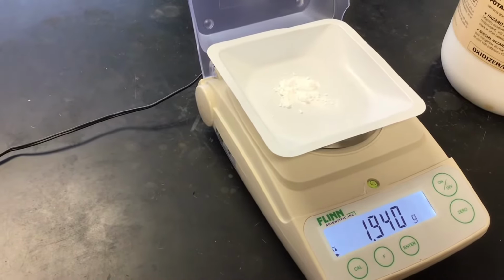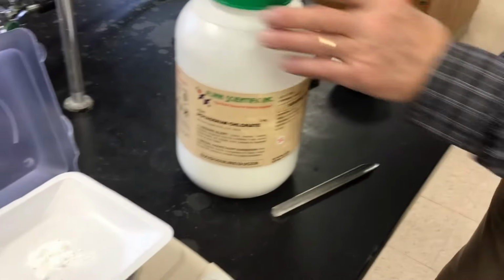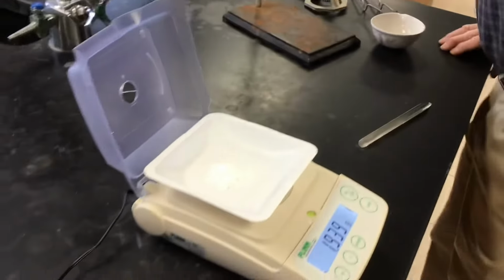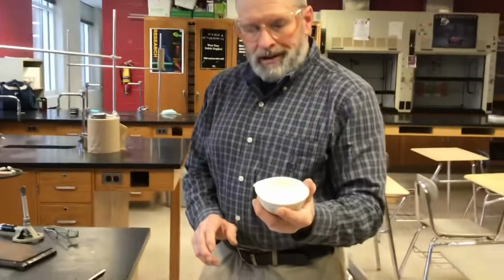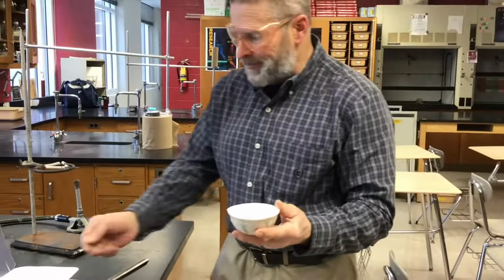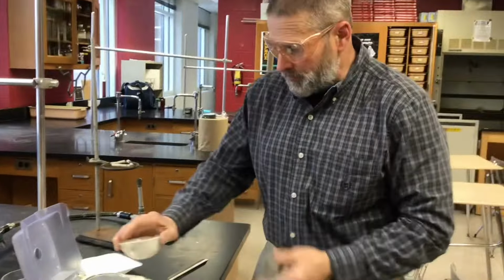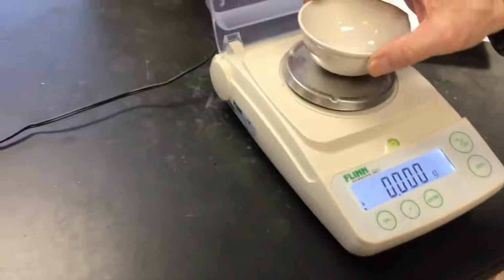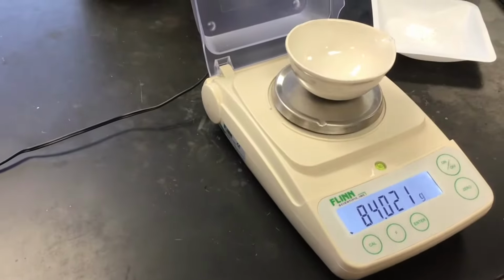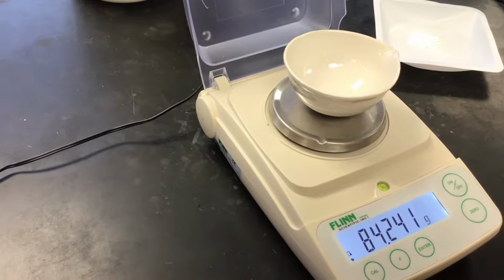We'll also want to have the mass of the evaporating dish. We're going to heat potassium chlorate because it's going to get up to a pretty high temperature. In a porcelain cup, or dish you could call it, it's called an evaporating dish. We'll need to know the mass of this. Oops. Zero it out. Yeah, because the product will be in the dish at the end, and we don't want to try to scrape it out.